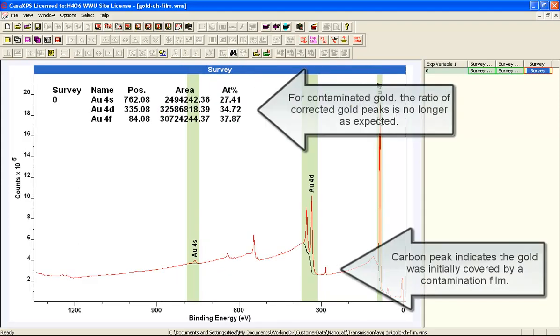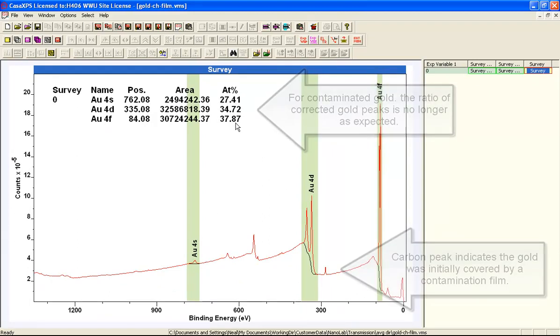However, if we look at the surface prior to cleaning, you can see that the quantification is really quite different.